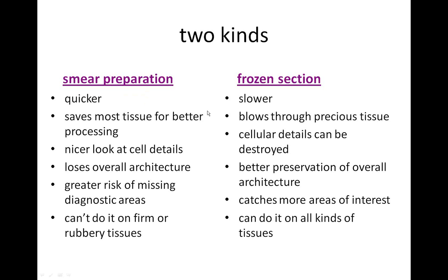Okay, so the smear preparation, basically what it entails is taking the tissue and smearing it on a glass slide and then quickly staining it and putting it under the microscope. And that takes maybe about 5 minutes. And so as you can see, it's pretty quick.